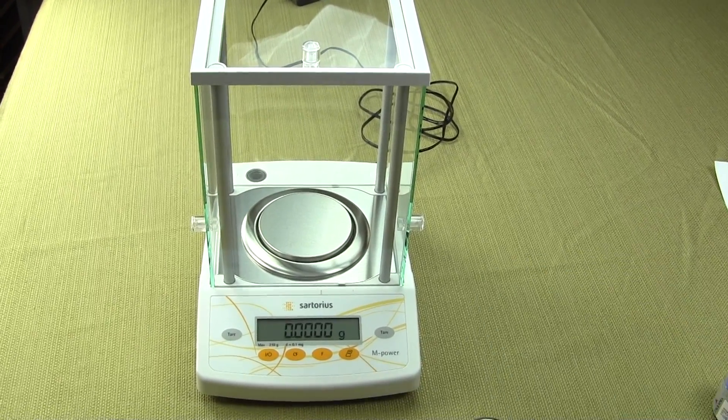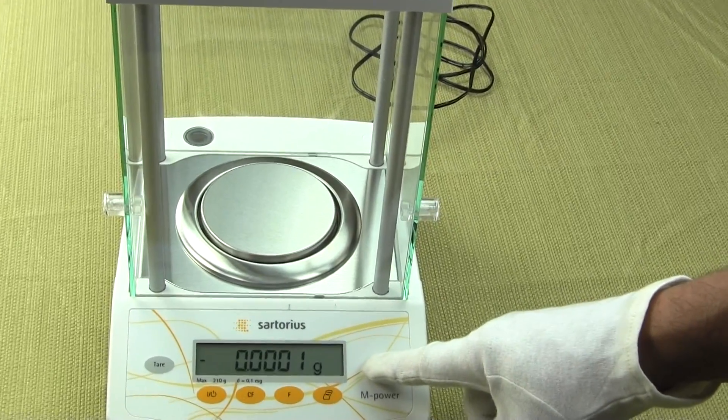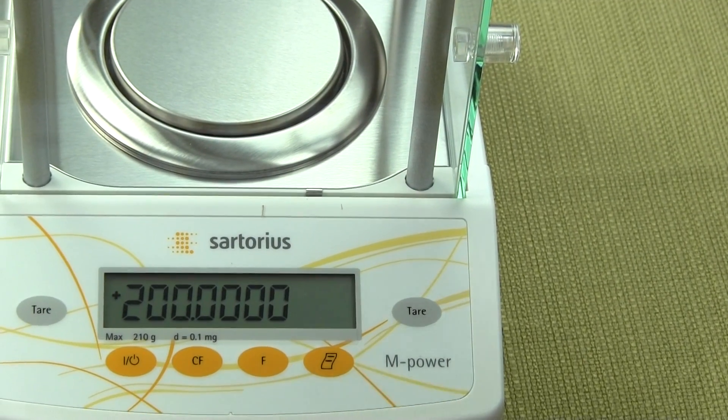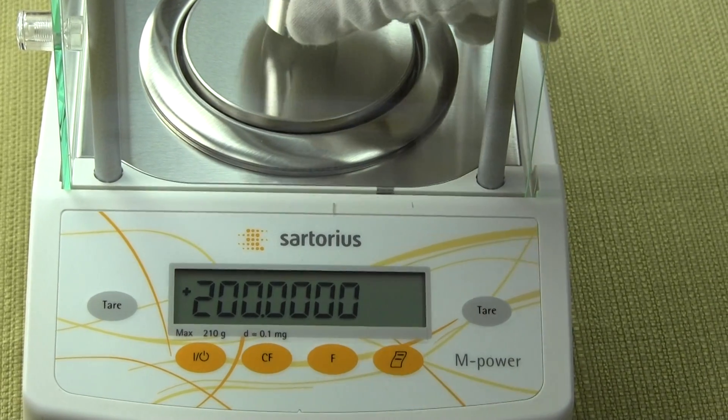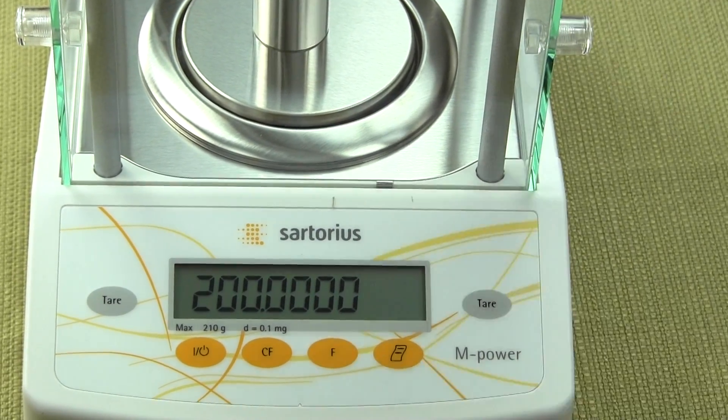You want to press the tare button. Simply press and hold the tare button down, and the balance will flash the required calibration weight. This is the AZ214 and it requires 200 grams. So you place the 200 grams on the center of the platform.